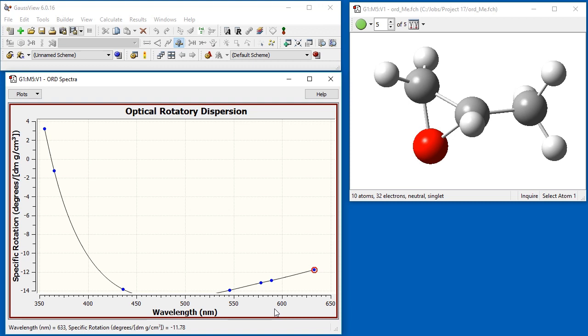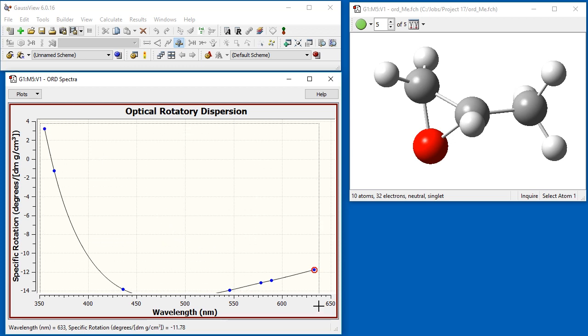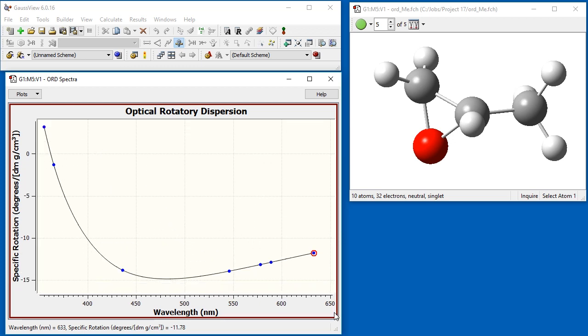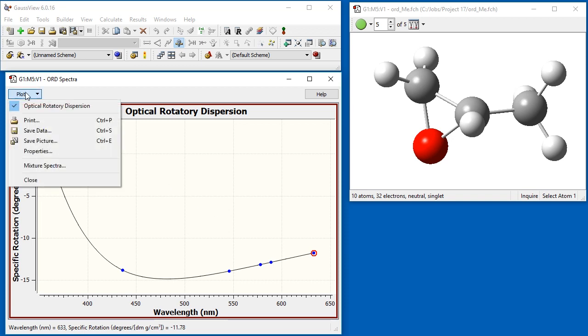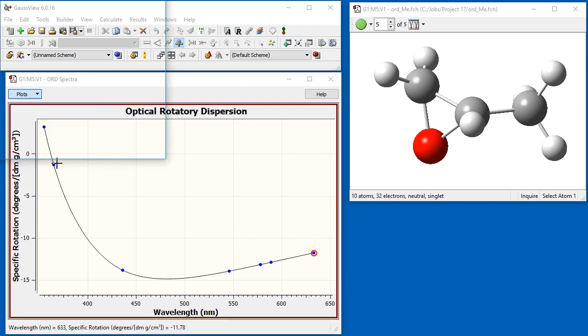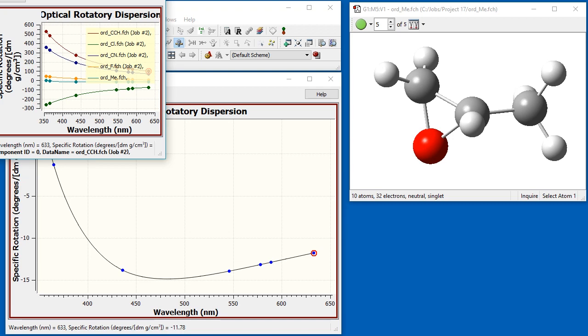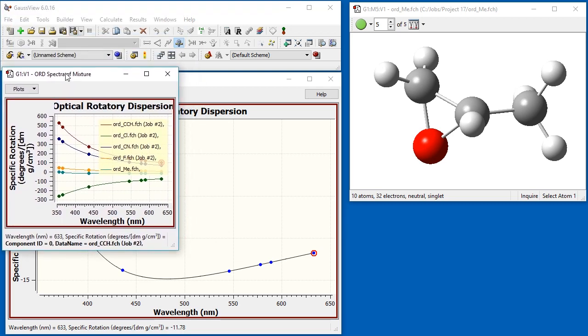GaussView occasionally misjudges the appropriate data range. If you zoom in on the curve and extend the zoom box below the x-axis, the entire curve becomes visible.